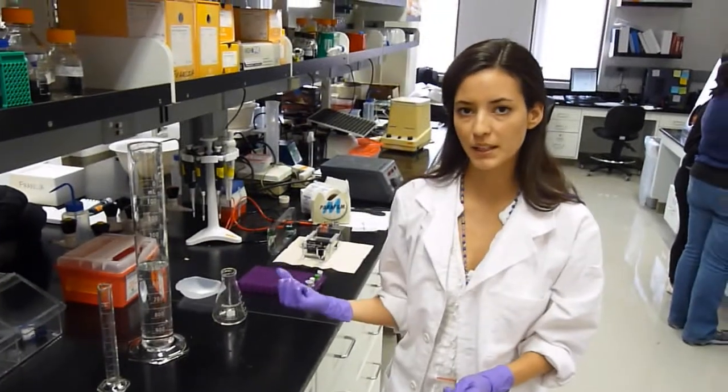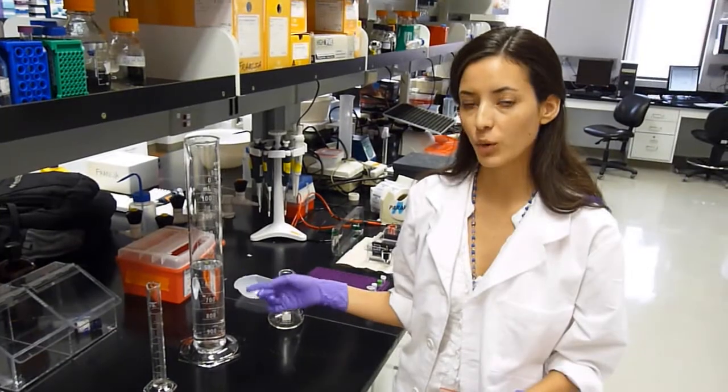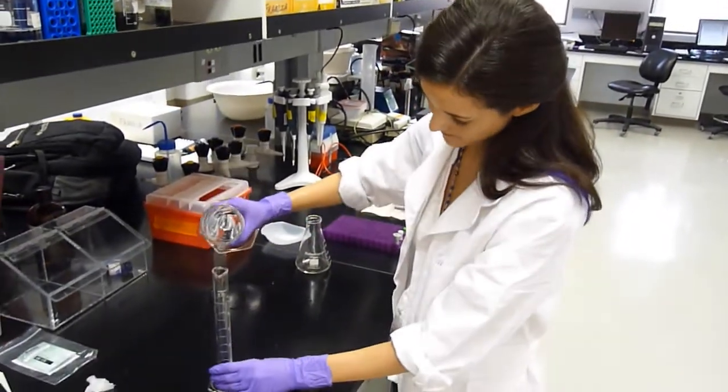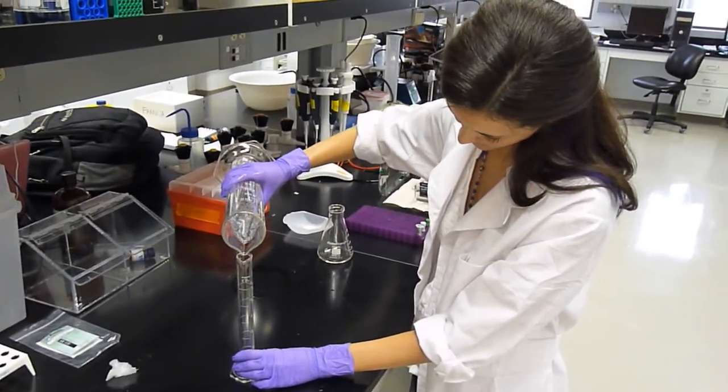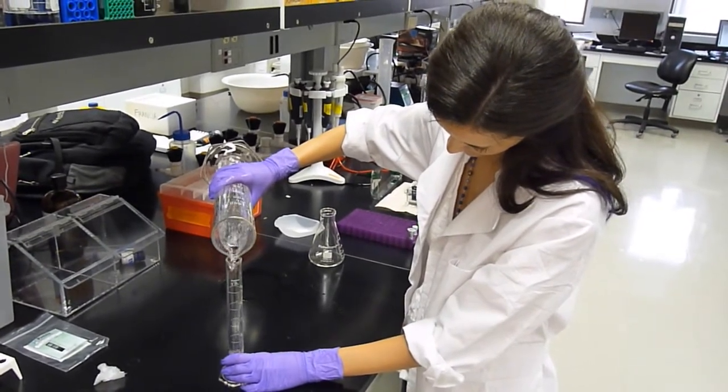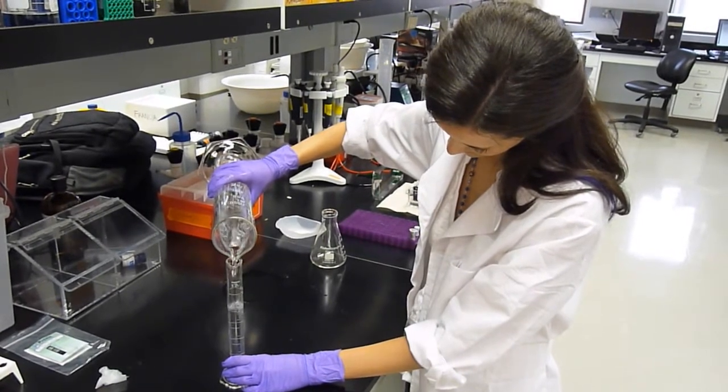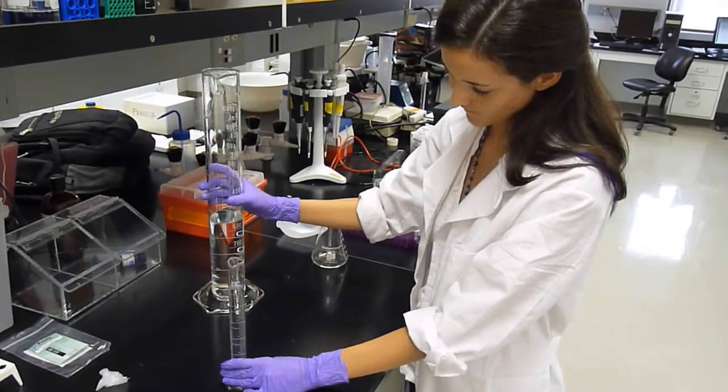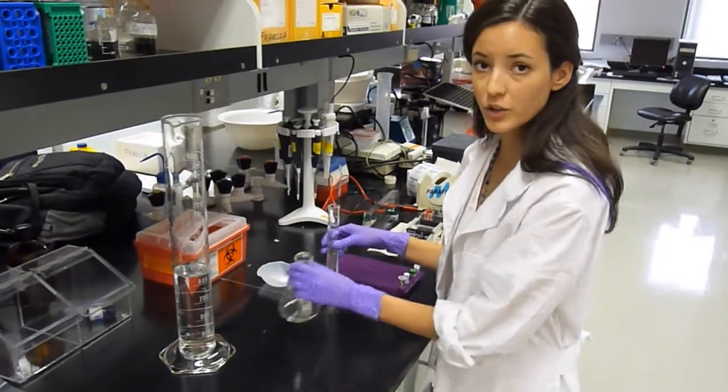Since the volume that we need is 50 ml, you want to measure out 50 ml of your 1 times TAE. Then you want to pour that into your Erlenmeyer flask.